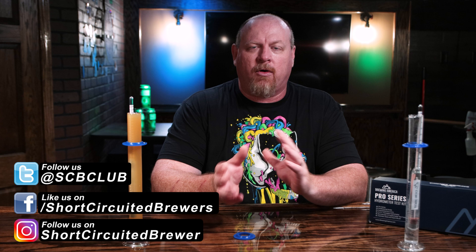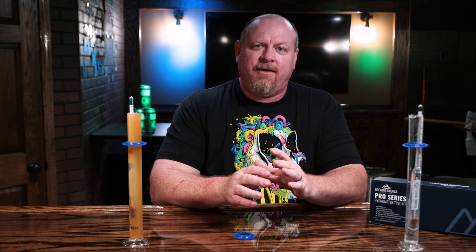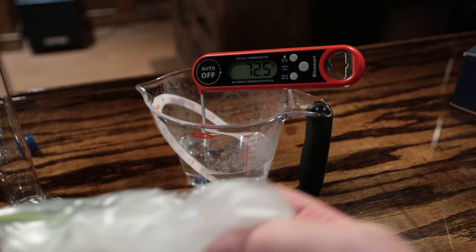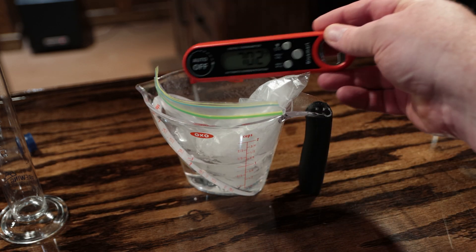Let's jump right into how to calibrate your hydrometer, or how to check the calibration on it. Most hydrometers that I have seen are calibrated at 60 degrees Fahrenheit, and what you need to do is get distilled water and bring it to 60 degrees Fahrenheit.